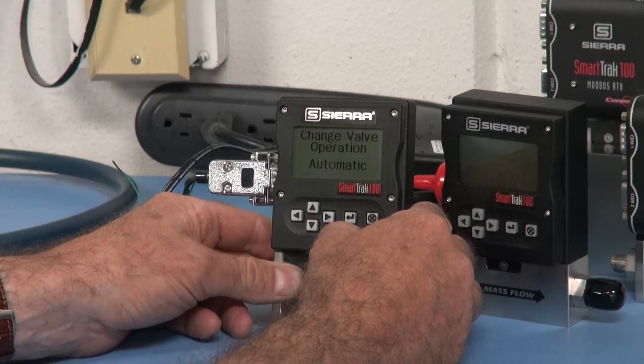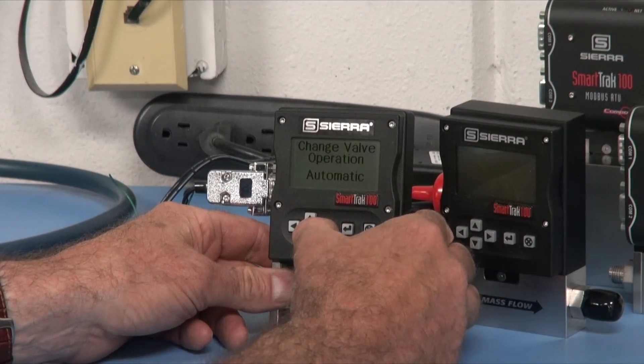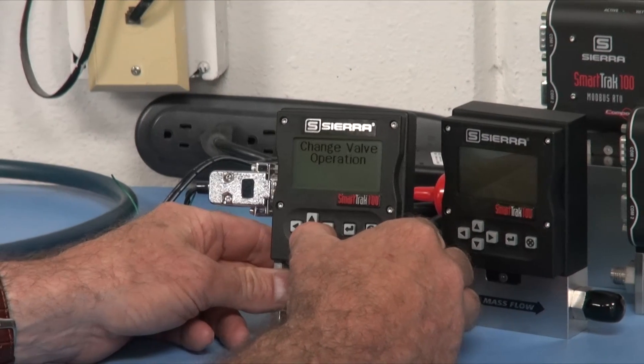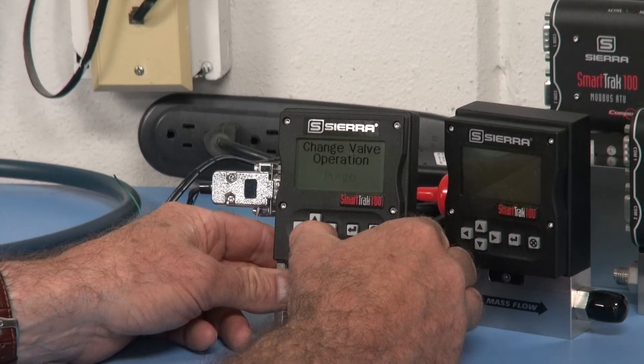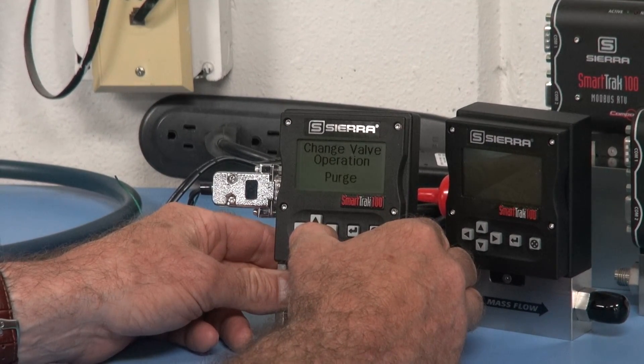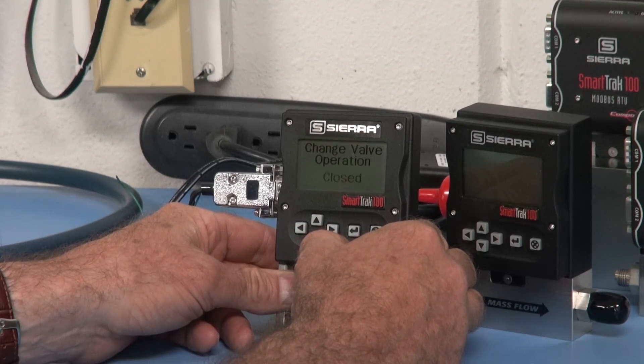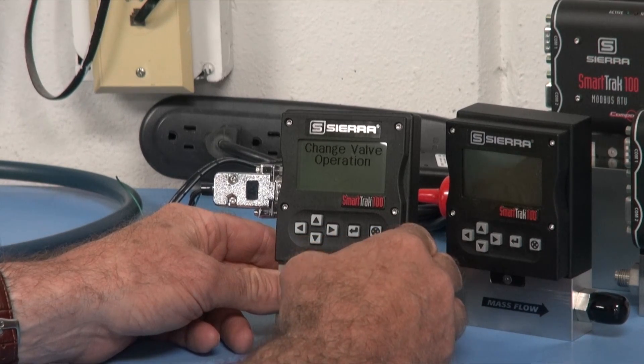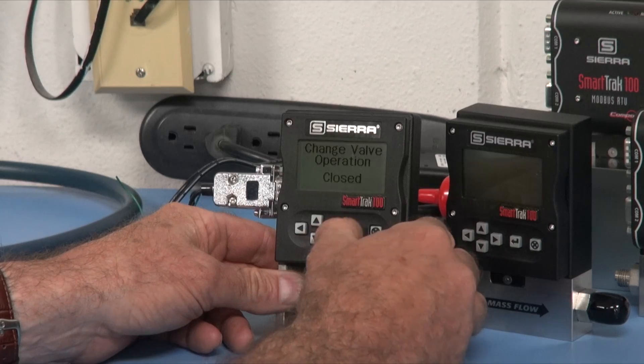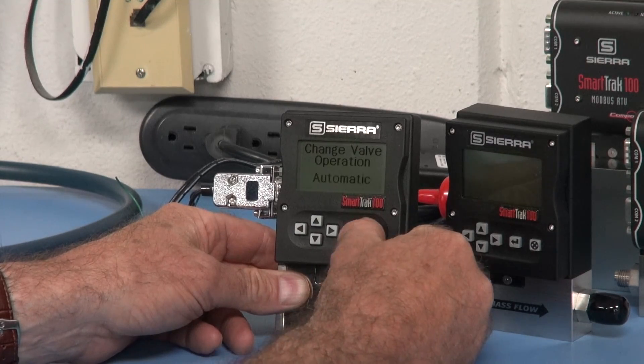Next menu, change valve operation. It can be automatic, it can be purge, which means it's open all the time for some function you want to run, or closed. In other words, it won't respond to a set point until you change it to automatic and press enter.